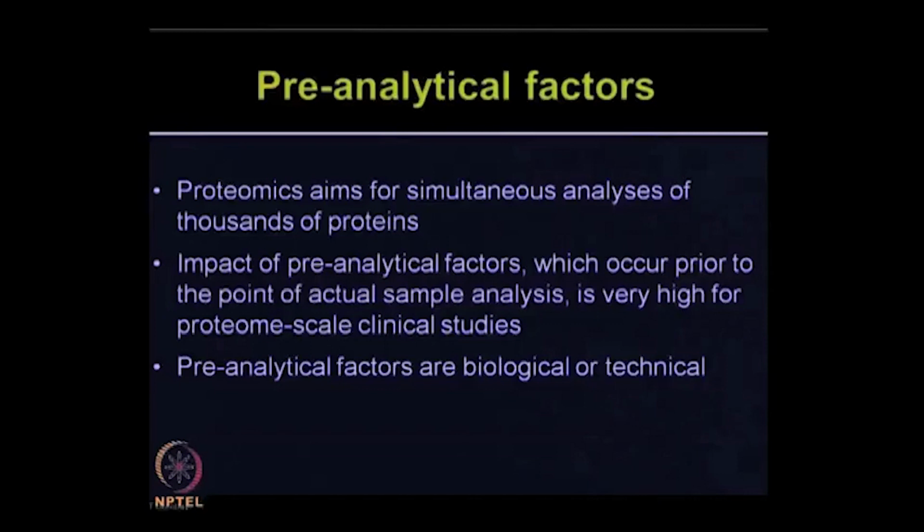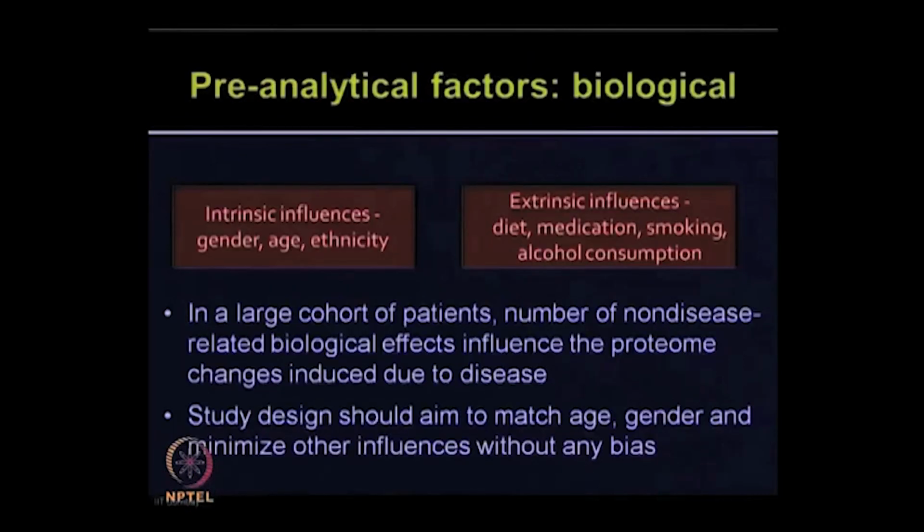The pre-analytical factors could be due to biological variations or it could be due to technical artifacts. So, your studies could be influenced by intrinsic factors or by extrinsic factors.